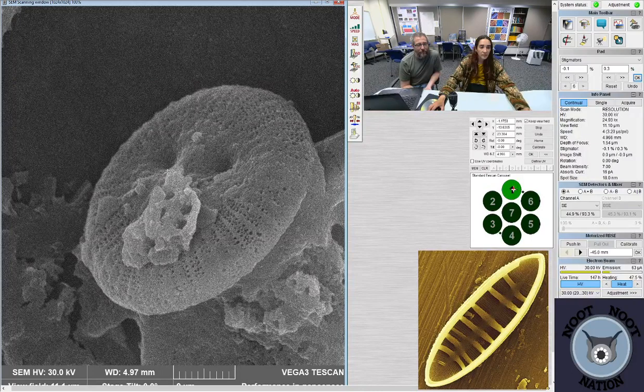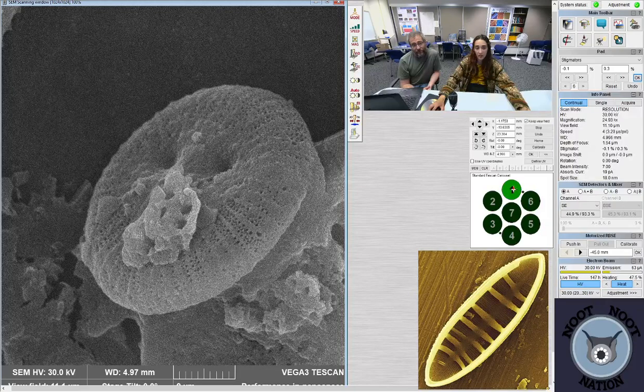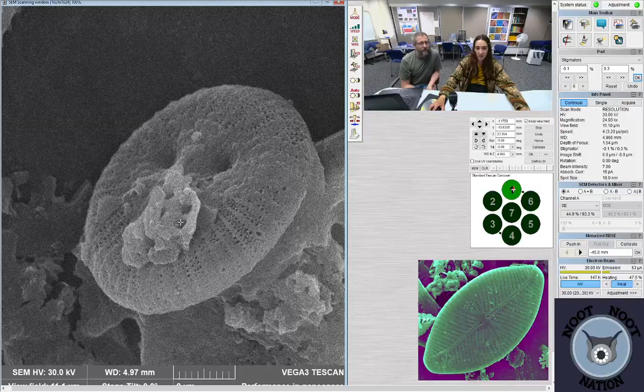And you can tell because of the little depressions. Yeah, there's supposed to be four of them? No, it's not required. Usually three. That one has three. So this one is the third one? It's just covering over. It's got like a piece of junk covering over the elevation.